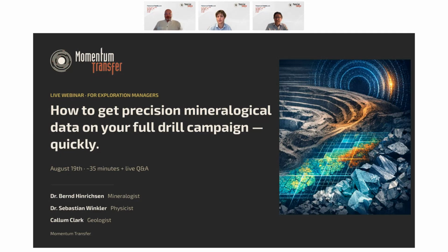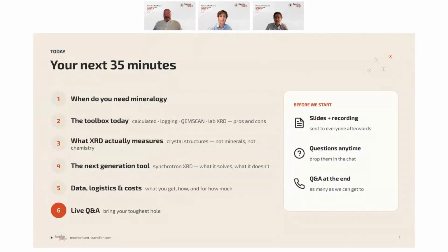And we are going to cover, in our very short session today, when do you need mineralogy? What can you use today for getting mineralogical data? We're going to dive then a little deeper into XRD. What is an XRD actually measuring and how does it work? We're going to then work towards the synchrotron XRD and what actually improves and where it doesn't.